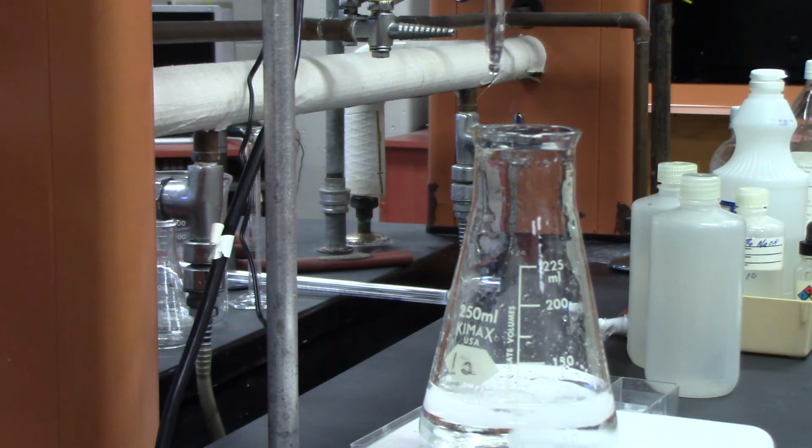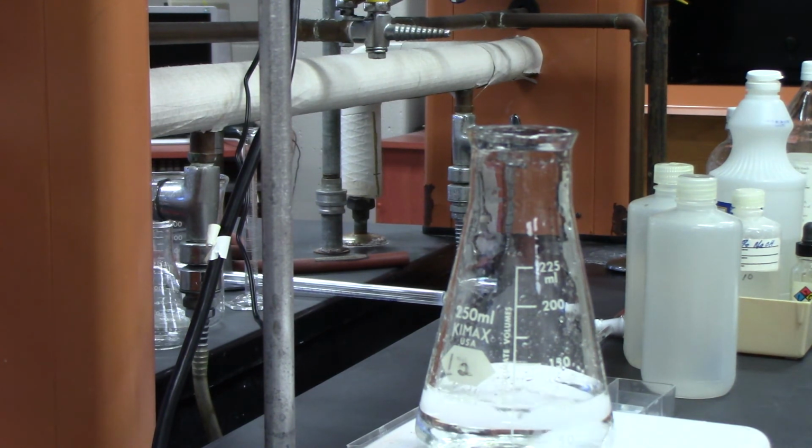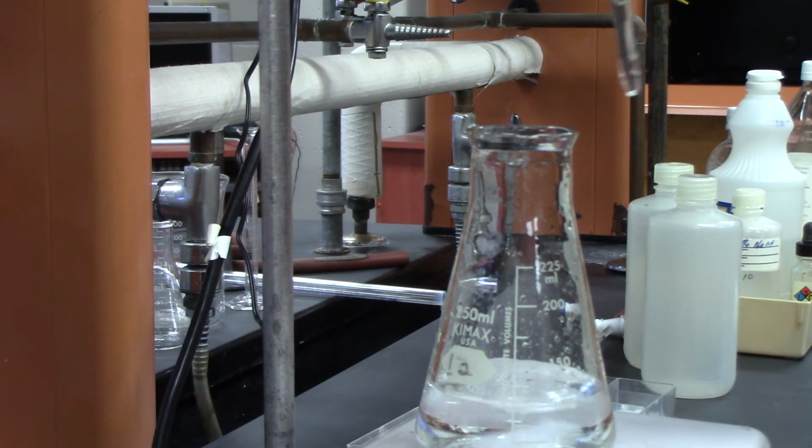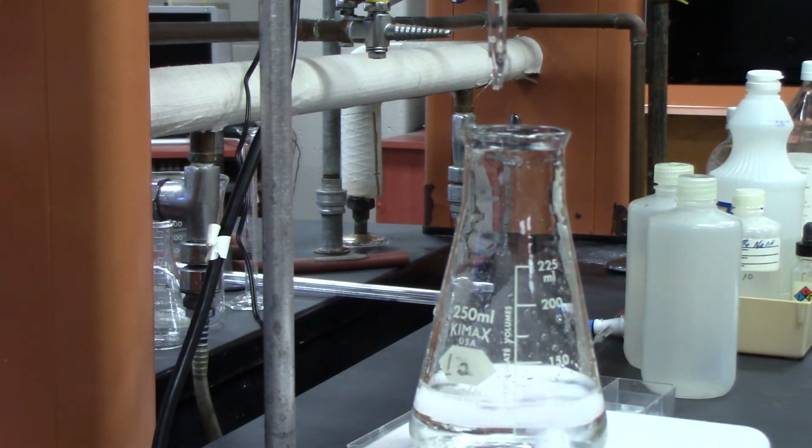Okay, so I'm going to add about 30 more of my base. So fill up, I don't know, up to 17.50. Okay. And the reason we're doing two samples of the same one is so we can get an average.